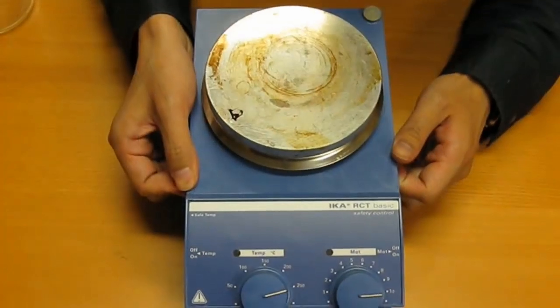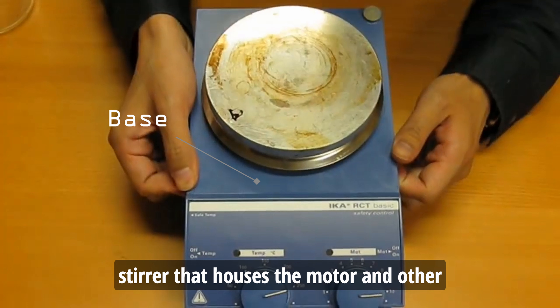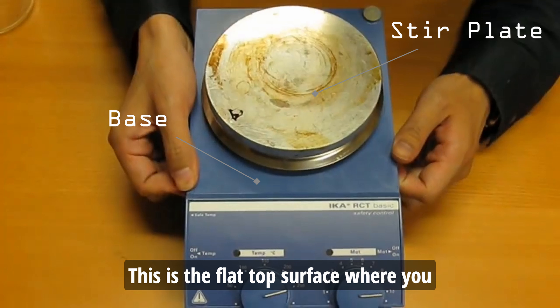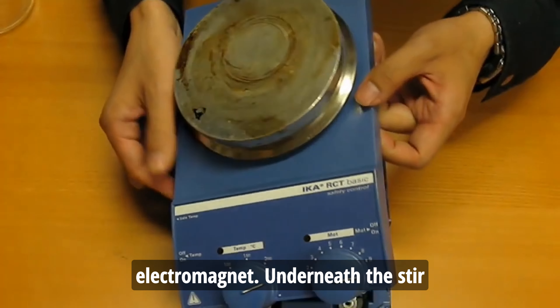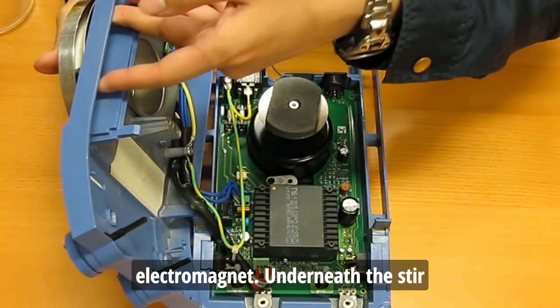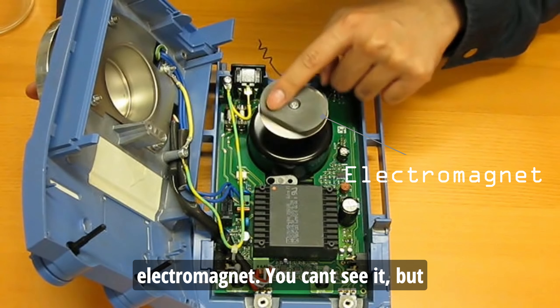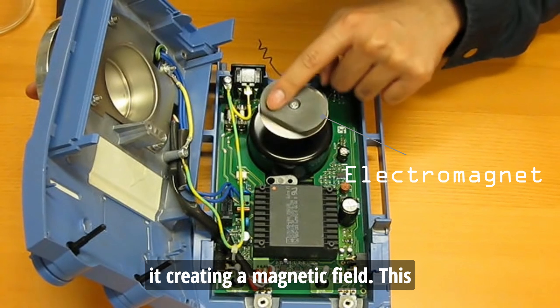Here's the breakdown. The base — this is the body of the stirrer that houses the motor and other components. The stir plate — this is the flat top surface where you place your flask. The electromagnet — underneath the stir plate sits a crucial component: an electromagnet. You can't see it, but when plugged in, electricity flows through it, creating a magnetic field.